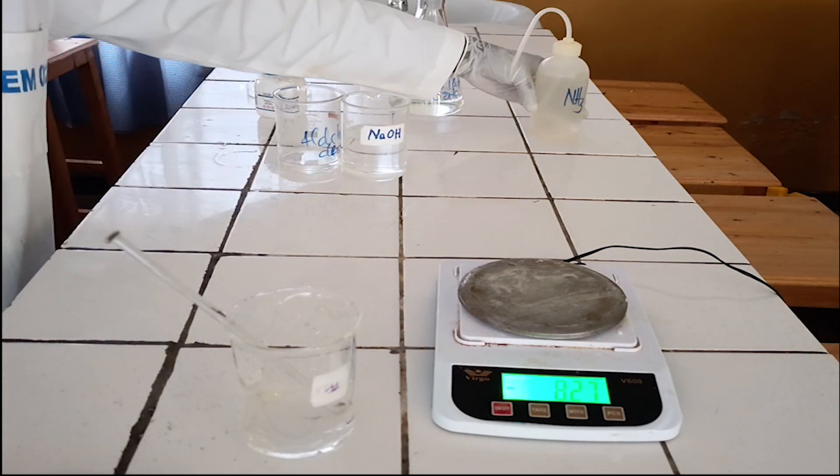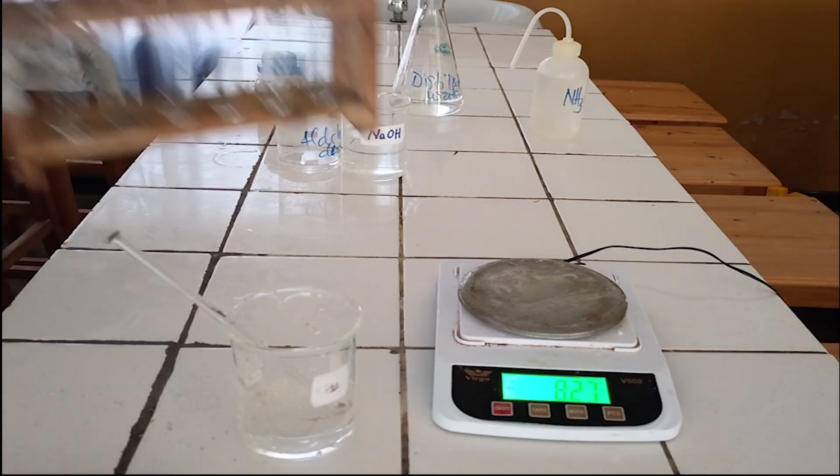Tollens Reagent is used to test the presence of aldehyde functional group in organic compounds.